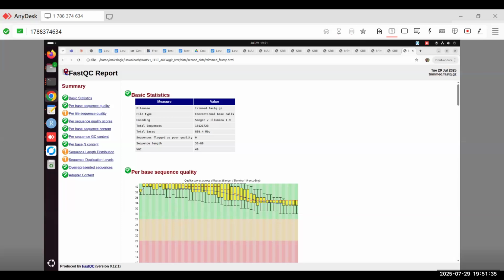If you have a significant number, like you have got 100, now you cannot work with 100, so try to increase it to 1.5. If it reduced to 20, then you can choose your threshold as 1.5. If instead of 20, you are getting 200 at 1.5, you can simply increase it to 2 there. And your differentially expressed genes will be filtered with a much harder filtering process. So this is the course I was talking about.